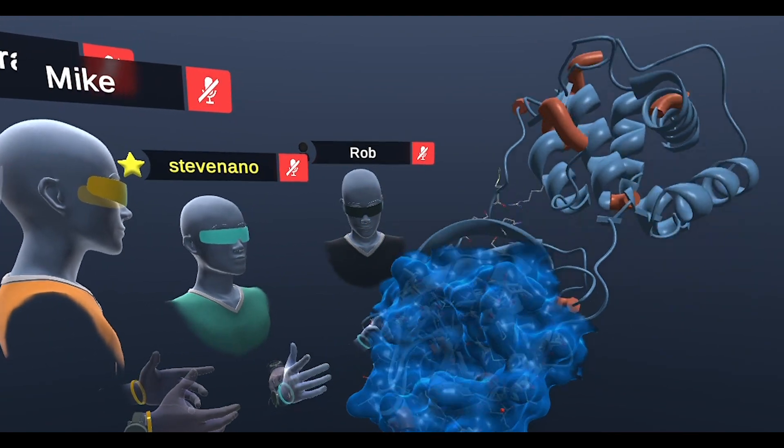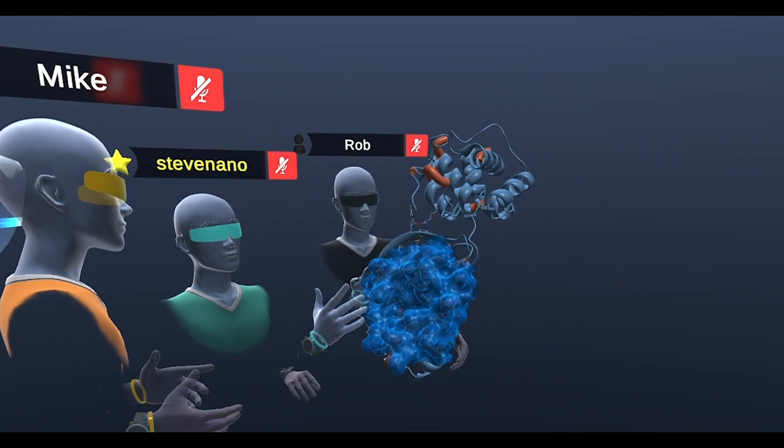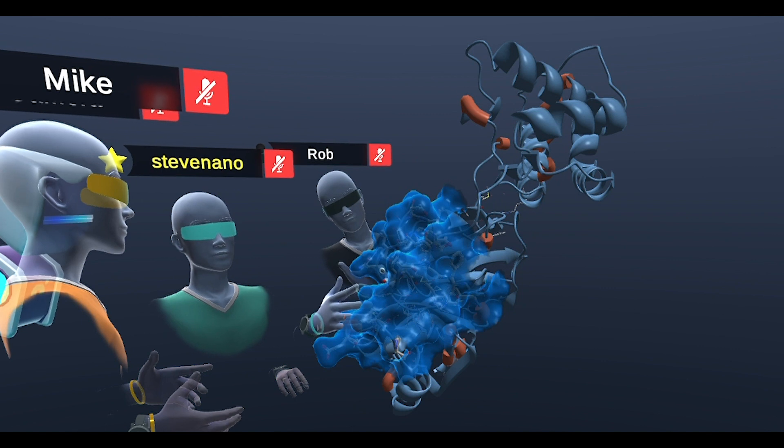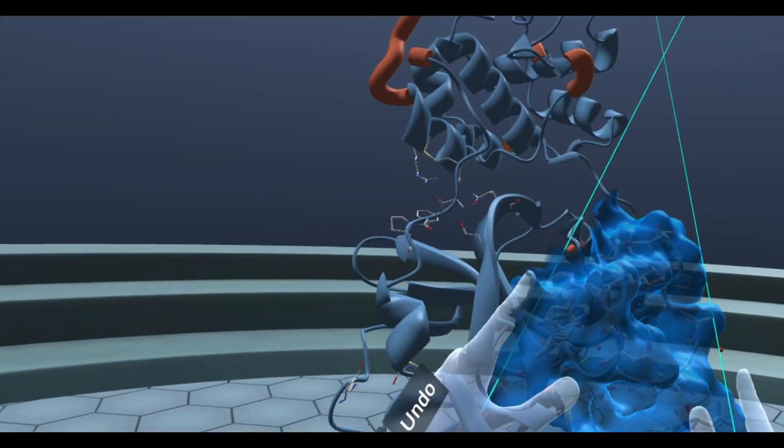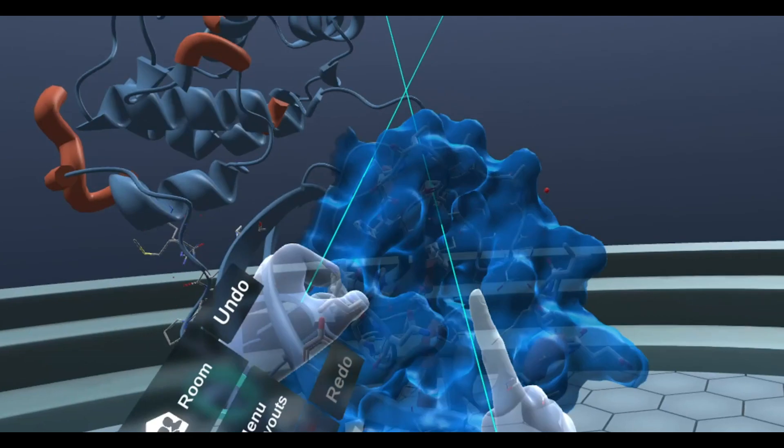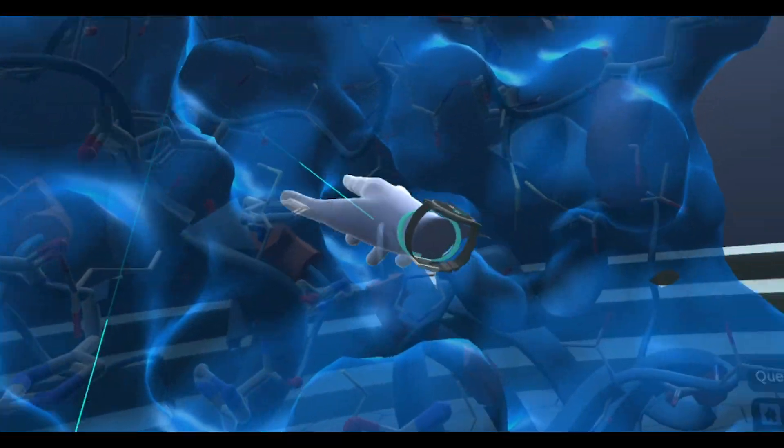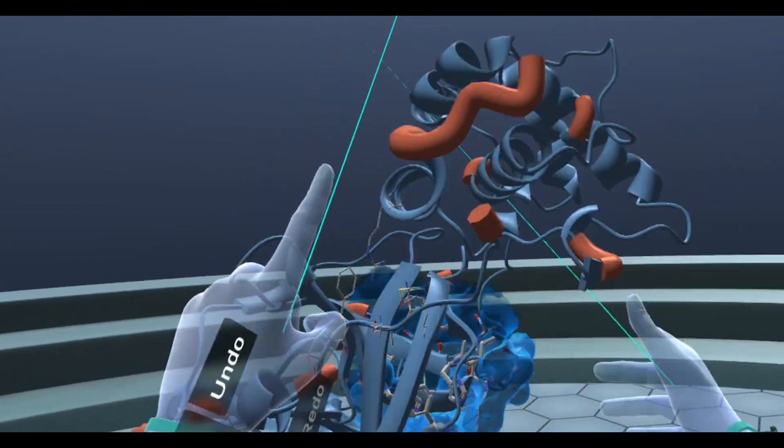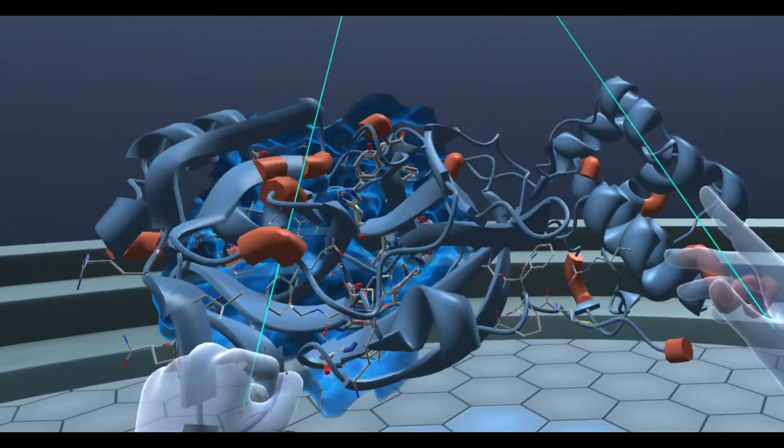Let's start out with just this one in blue. So over here, this is the new protease structure for SARS-CoV-2 that causes the COVID-19 disease. You know, there's this main area of interest which is this binding pocket right here. And if we look, we've highlighted a few areas in orange in the putty view.